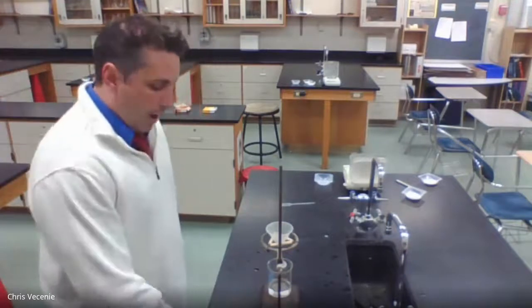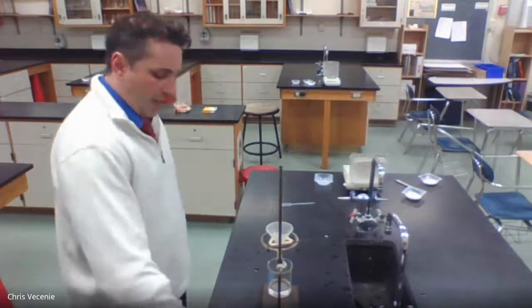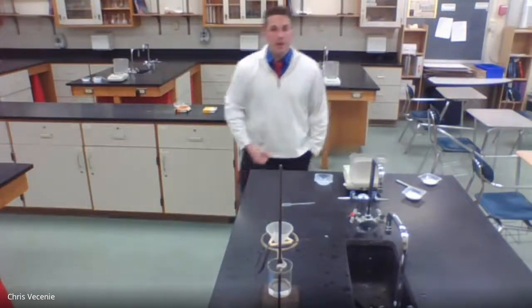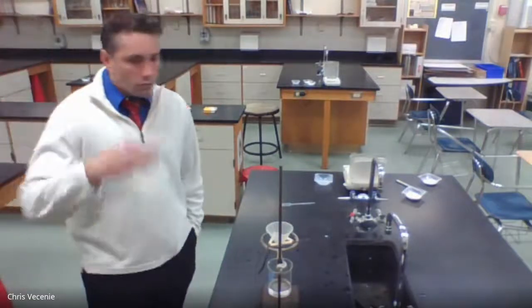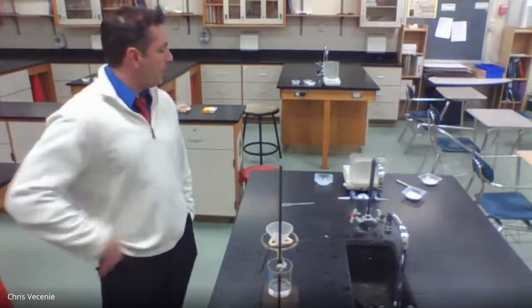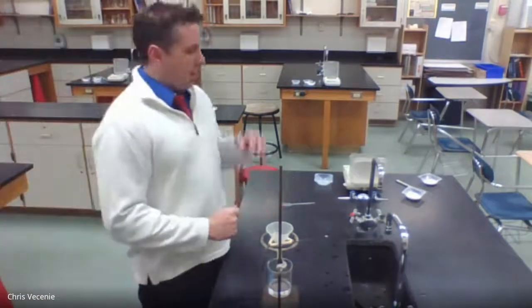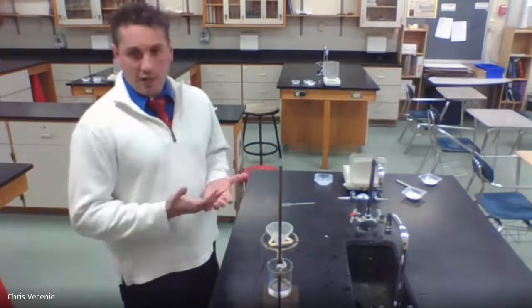Okay, now I'm not going to make you guys wait through that portion. What I will do is after the 8 minutes goes by, I will go back. Right, I will bring it up here. I'll get the mass of it, and like before, I'll send you a picture of the filter paper with the calcium carbonate on the balance. Right, I will also send you a picture of trial 2, right, where I would have been taking the 0.5 and the 1.0 instead, doing the same process and getting you the same results.